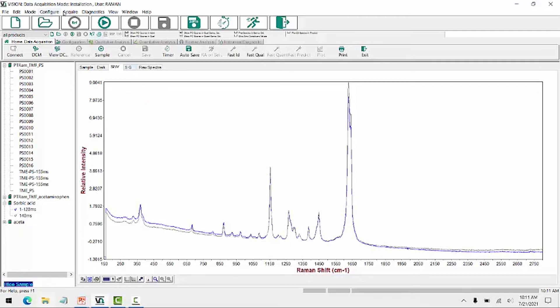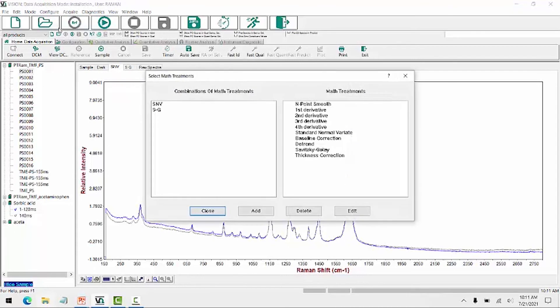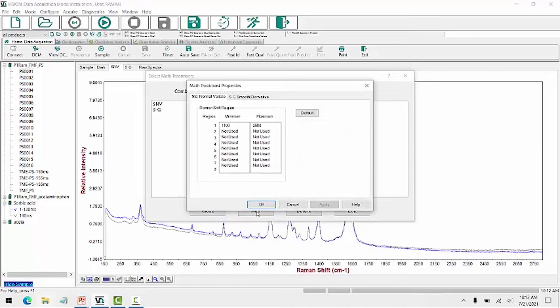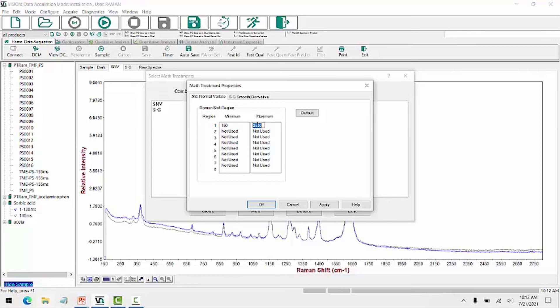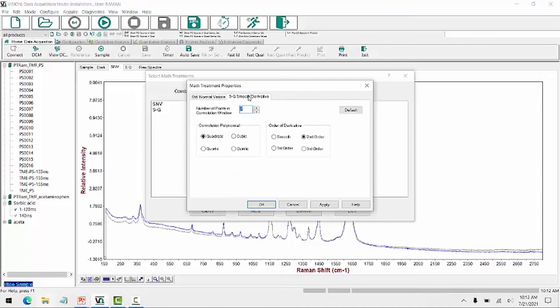To add different preprocessings, we can go under configure, math treatments. And here I have the SNV and the Savitzky-Golay preprocessing added. I could add a combination of the two by choosing both, click Add. I need to make sure that I change the range to that of the actual data, which for this instrument is from 150 to 2,800 wavenumbers. So I type in those values, 2,800. And then for my derivative, I want to use 25 points. For Raman spectra, we use 25, even up to 50 points smoothing. And I'll use it as a second derivative. So I'll apply this.